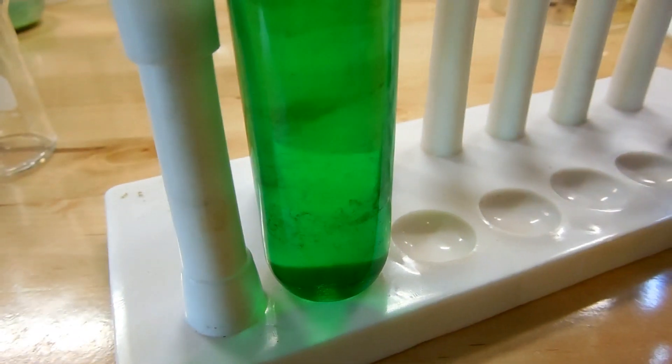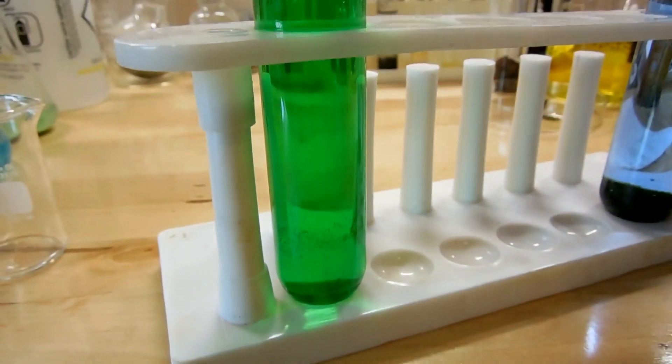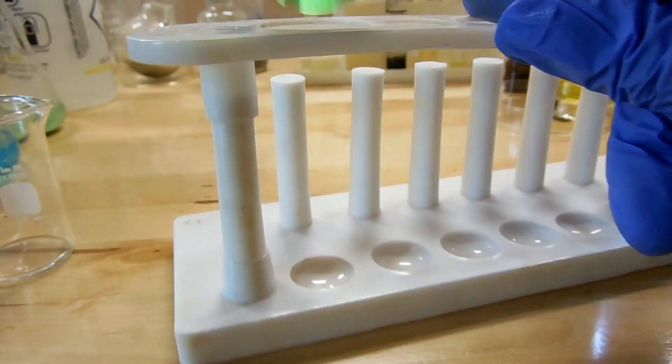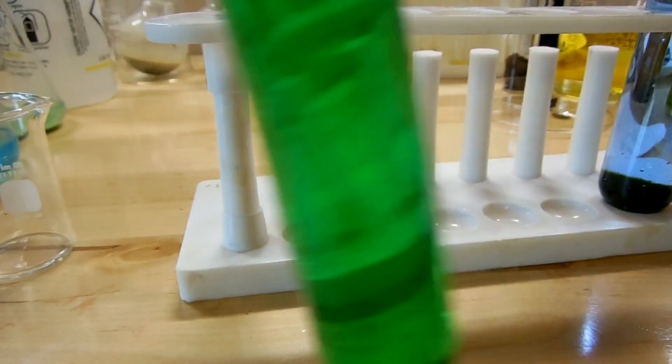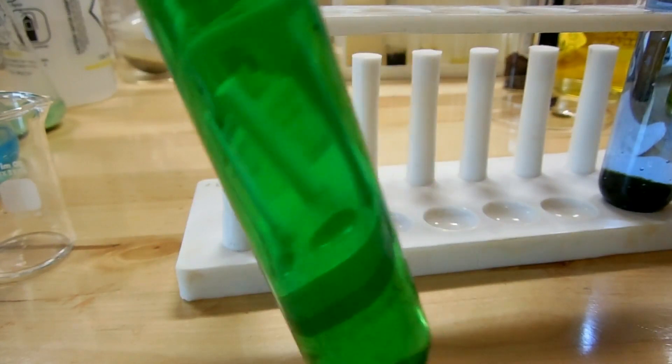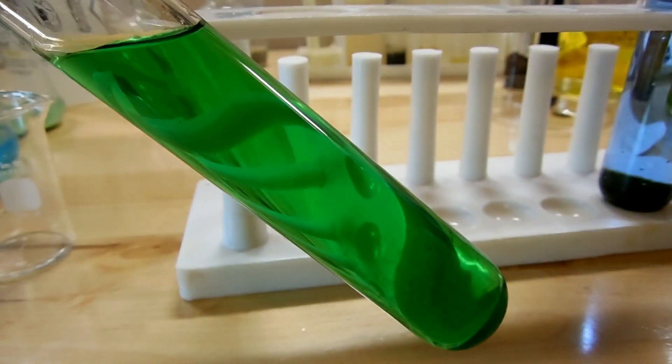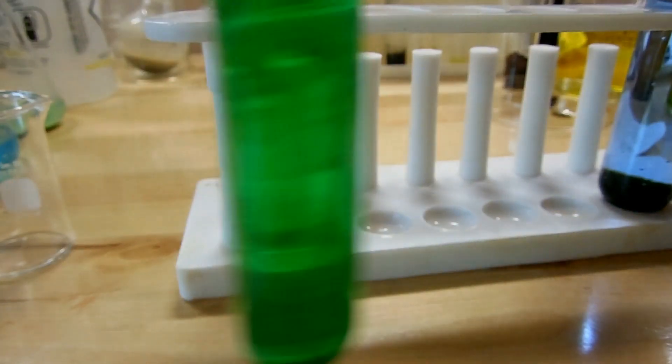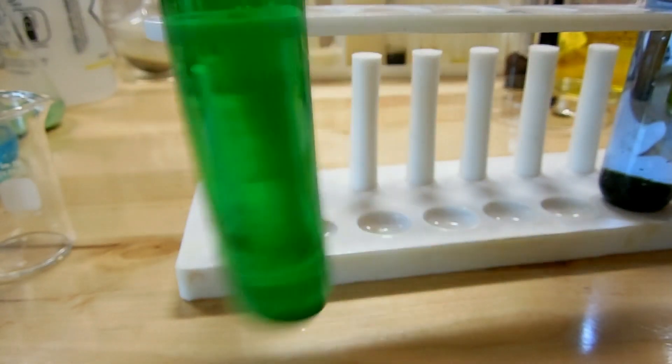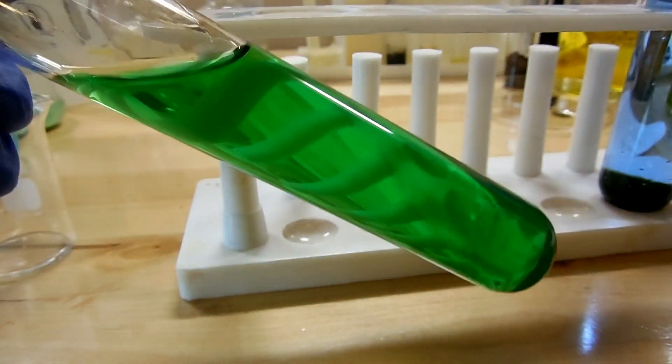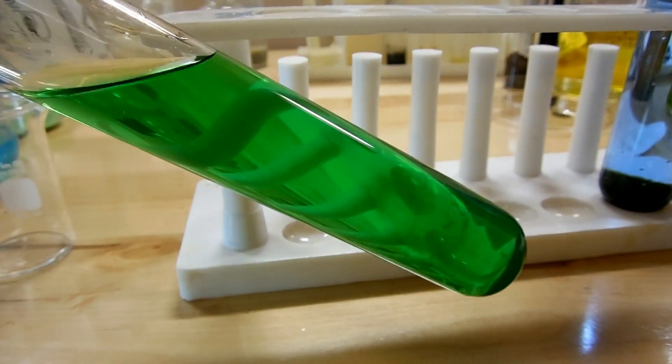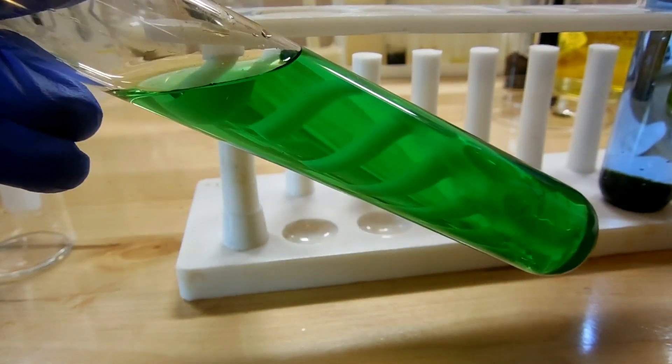And you can see we get just a gorgeous color change to a beautiful emerald green. This is one of the things I like the most about copper chemistry, is that the colors are so varied and you can do one experiment and see so many different things happening. So just a gorgeous range of colors.